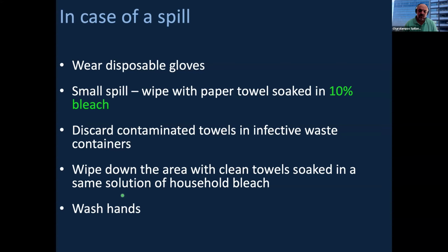But if the spill is larger, then you should do about the same thing but for a longer period of time. So again, you can soak paper towels in bleach, put it on the spill, leave it for at least 30 minutes, because even for bleach, it takes time to kill potential biohazardous microorganisms. Then dispose of the paper towels in designated containers, replace the protective equipment, inform your colleagues. Instead of going around and screaming, you could just inform your colleagues.